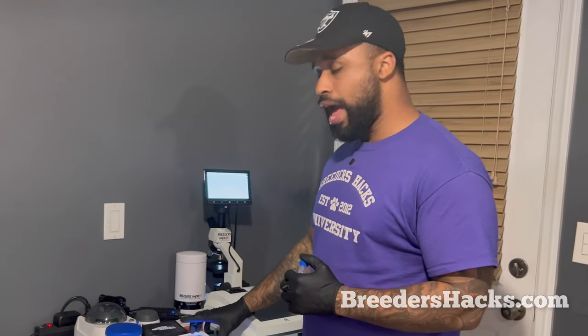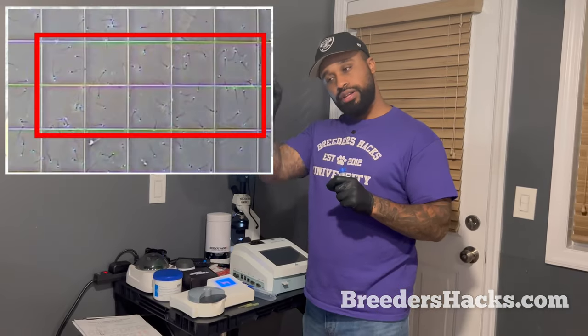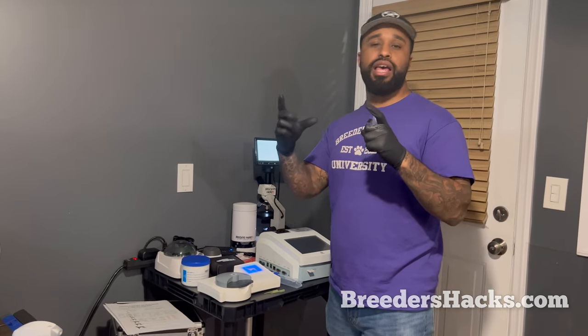So there's one other thing that you could use if you didn't have a photometer, right? What you could use is what we used to use, which is these counting slides or a hemocytometer. It's a microscope slide. I'll put a picture somewhere here. You do some simple math and it'll allow you to count how many sperm cells are in a box. Based off of how many are inside like 10 boxes, that gives you your sperm count for the entire collection. It takes a little bit more practice to learn how to do that.